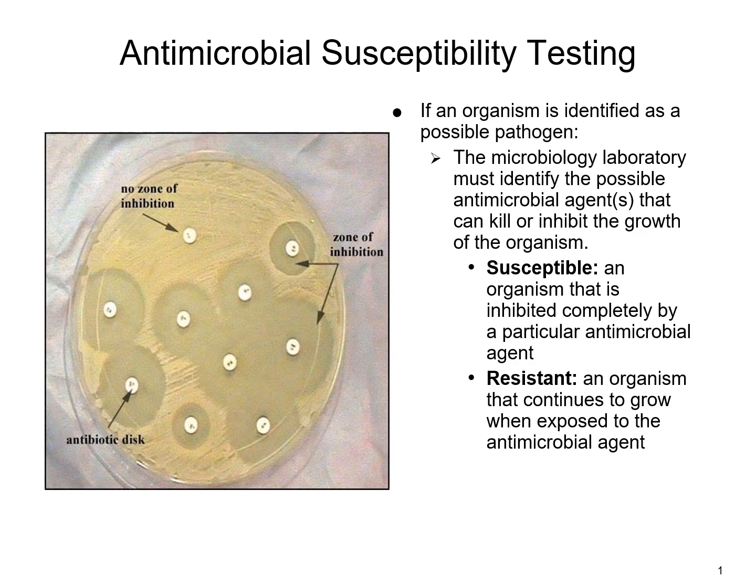Here we've got an image of a culture plate in which the bacteria was spread out on the plate. They made a lawn of this bacteria, and you'll learn more detail of this. And then they placed all these little antibiotic discs, which allows the antibiotic in that disc to start to leach out into the agar.